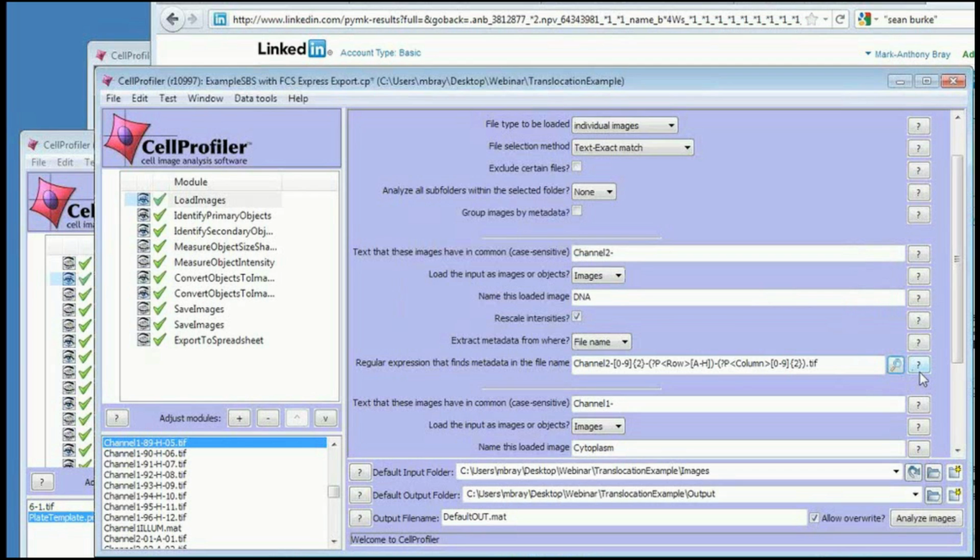Great. Okay, we have one last question, and then I'll wrap up. It's for Mark. It says, can CellProfiler with FCS Express calculate the median and MAD per object populations after classification for use to calculate the SSMD stats of the positive versus negative phenotypes?